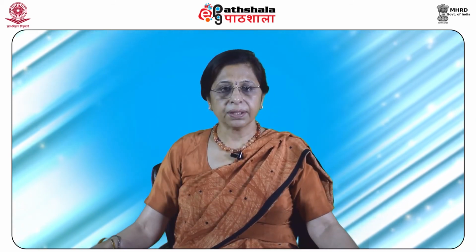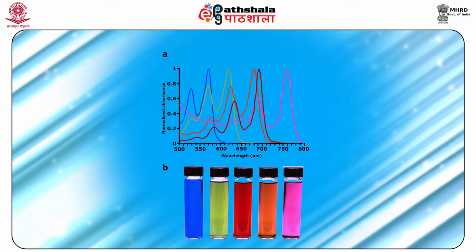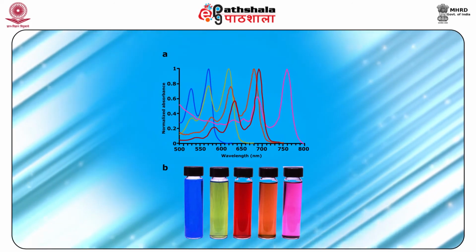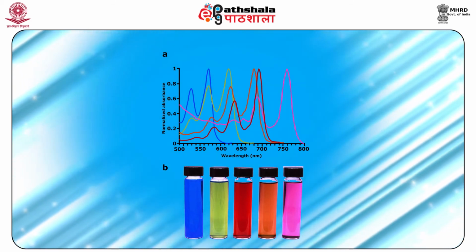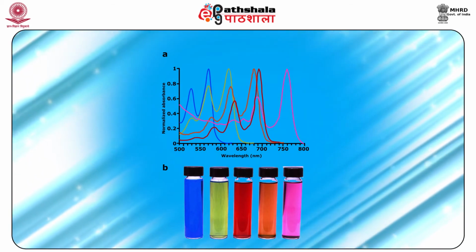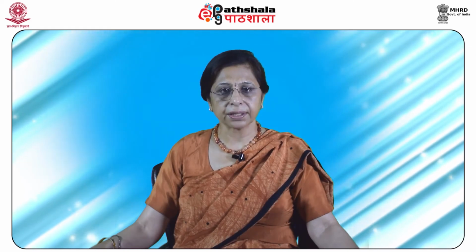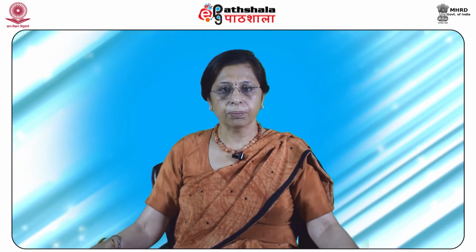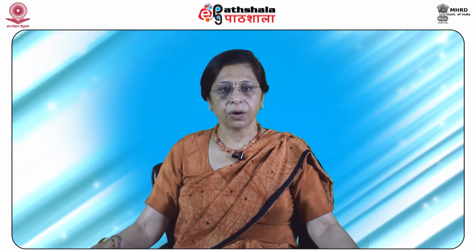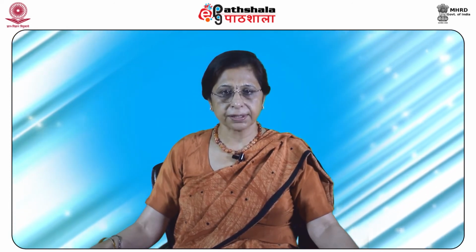Now, next is, what is the effect of solvent on visible or UV spectroscopy? The solvent is used for dissolving the compound under investigation and has a large effect on the UV-visible spectra of a compound. The fine structure of absorption bands is blurred due to interaction of the solvent and the solute molecules. This effect is more pronounced in polar solvents as compared to non-polar solvents. The fine structure of UV-visible spectra is best observed in the vapor phase.